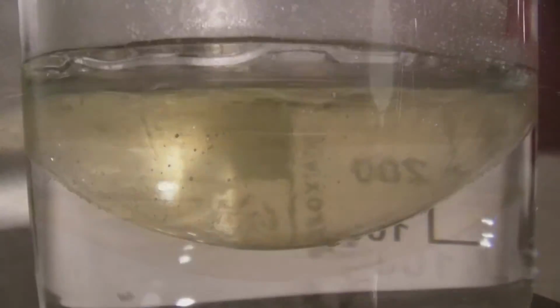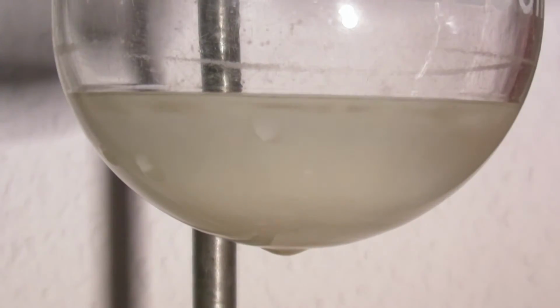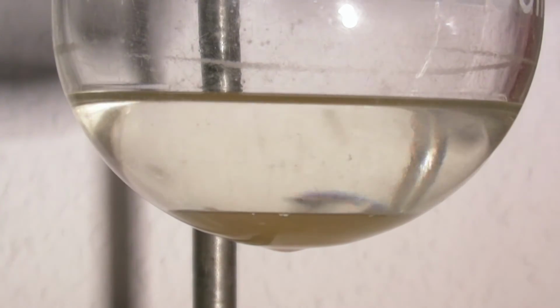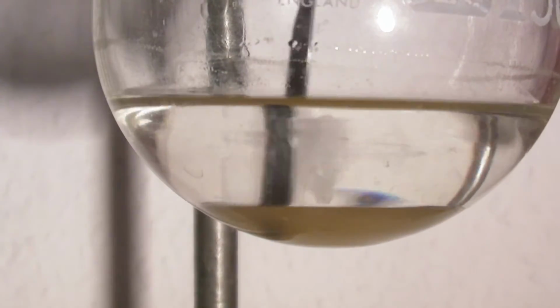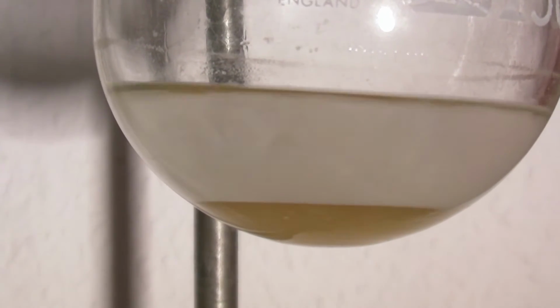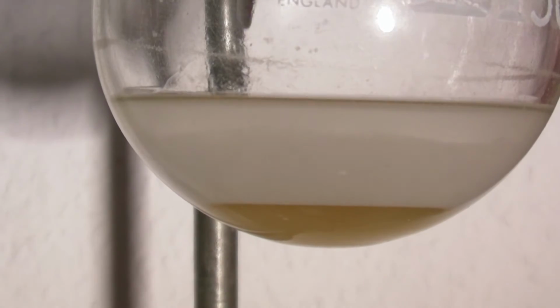The different densities cause two layers to form, which mix slowly after a while. While cooling down, little droplets formed and collected at the bottom. When the spatula was held into the solution, it turned cloudy, but no crystallization took place, which was quite interesting. Only strong scratching on the walls of the flask caused the crystallization to take place.